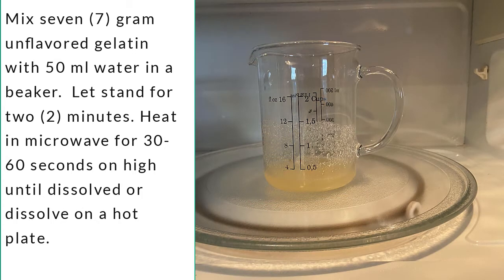Mix 7 grams unflavored gelatin with 50 milliliters of water in a beaker. Let it stand for two minutes and then heat in a microwave for 30 to 40 seconds. Once it is dissolved, take it out.